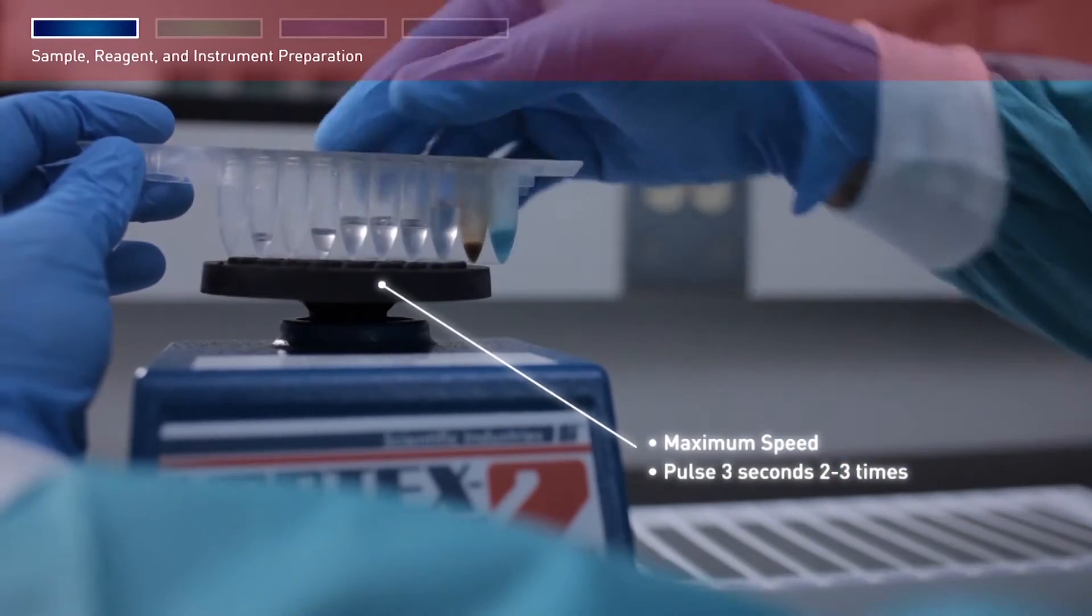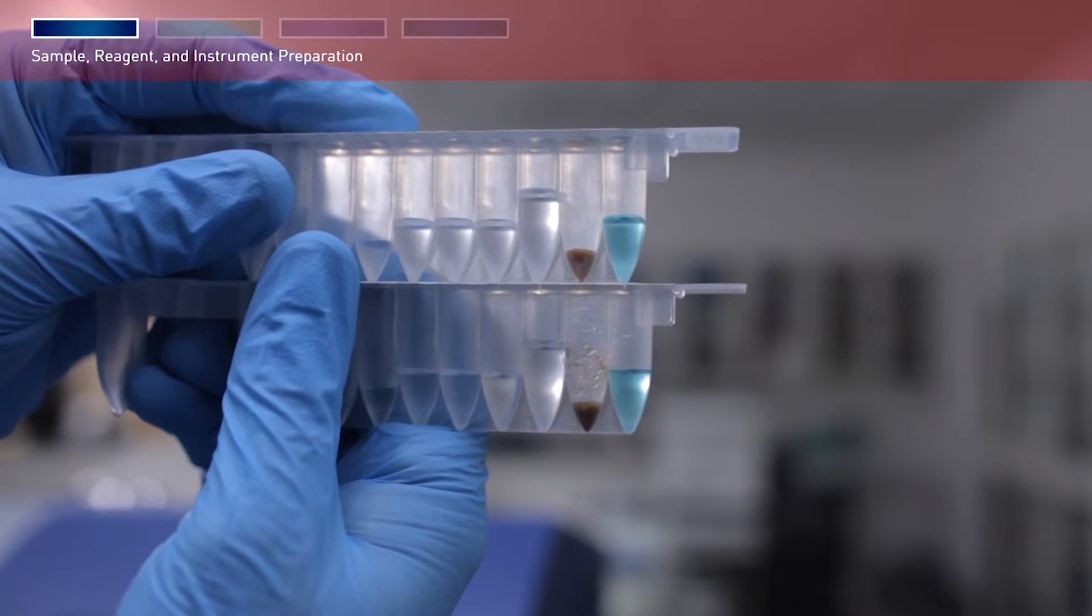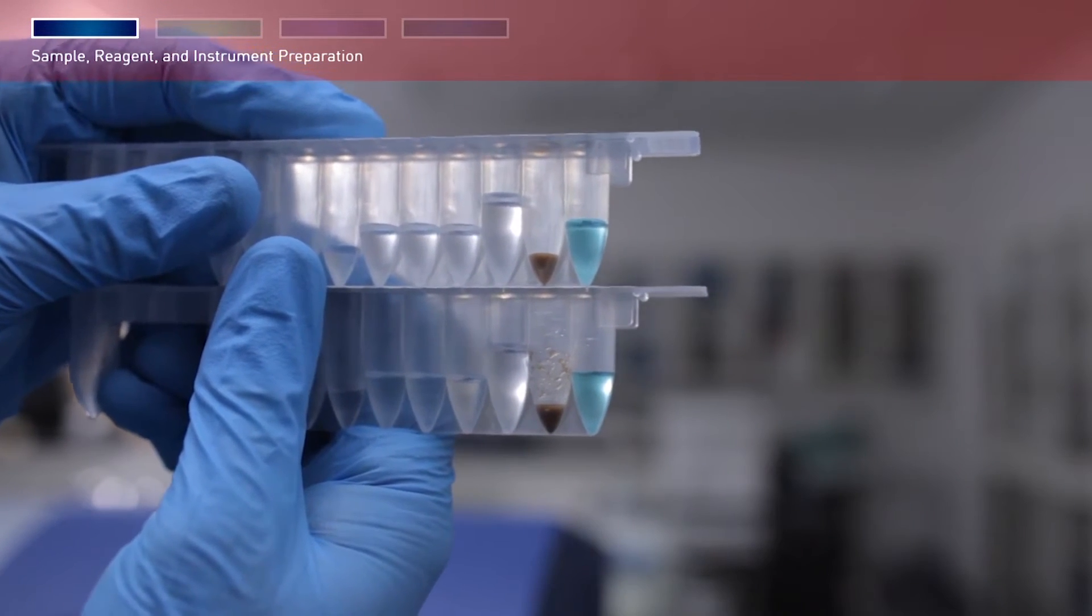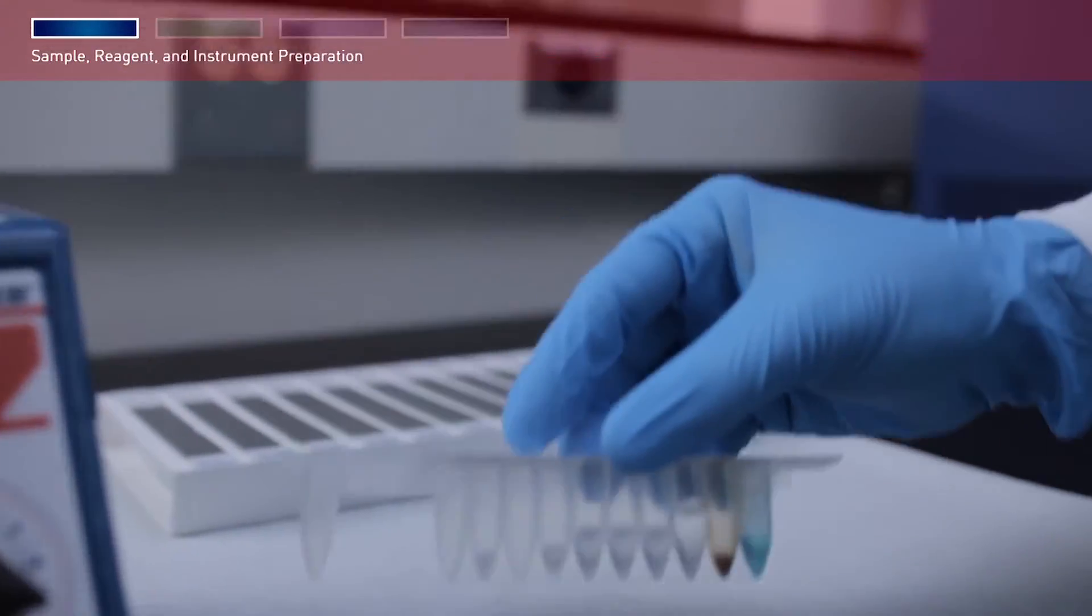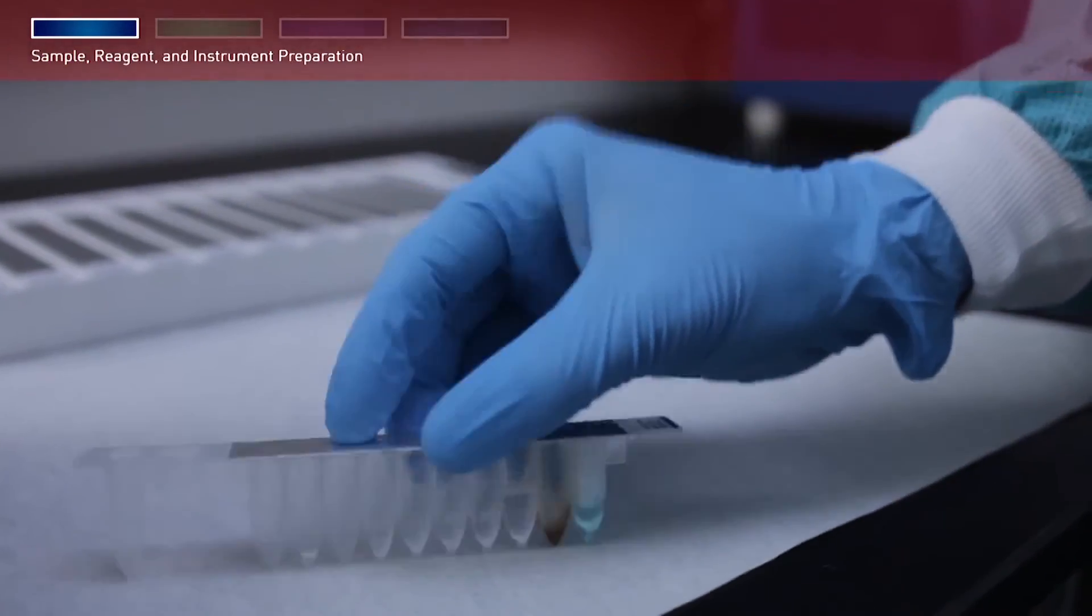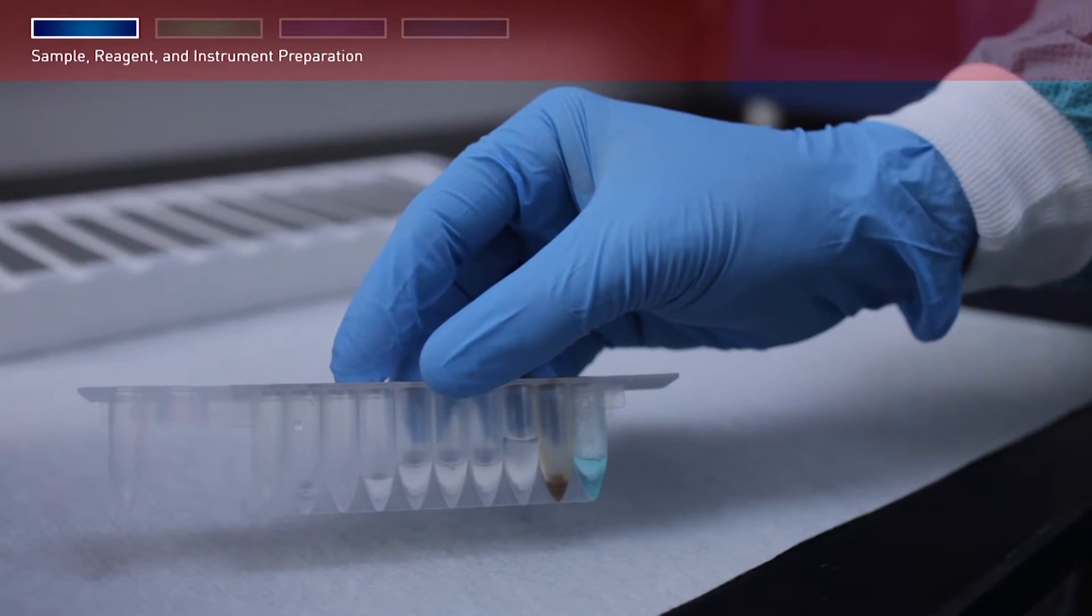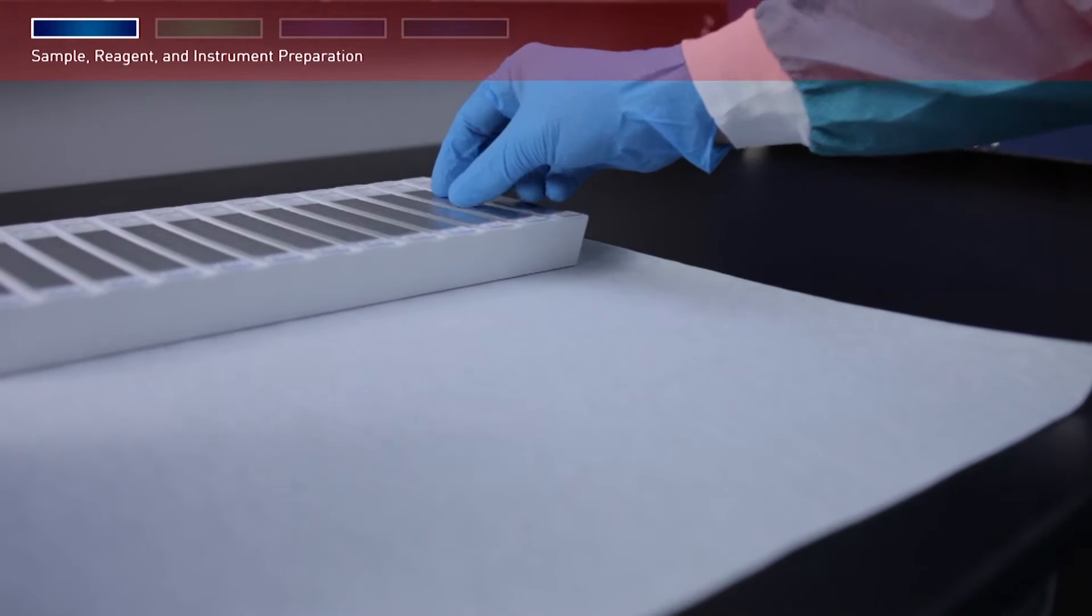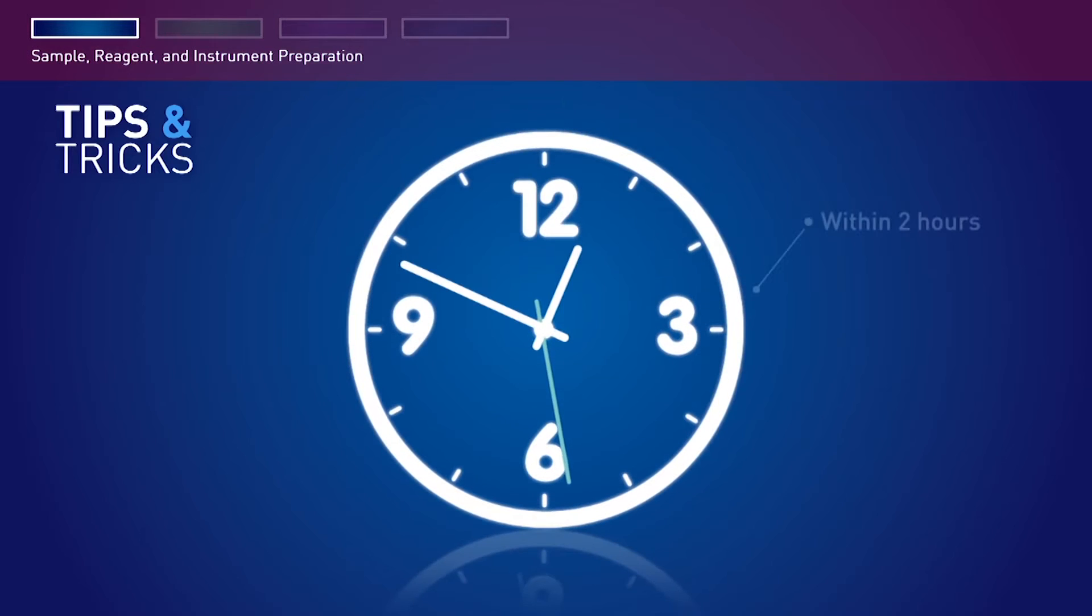Visually confirm that the magnetic particles are resuspended. If not, repeat vortexing. Hold the cartridge foil side up, then tap the cartridge on the counter several times to deposit any particles or liquid droplets into the bottom of the compartments. After resuspending the magnetic particles, use the cartridges within two hours or perform this step again before using.